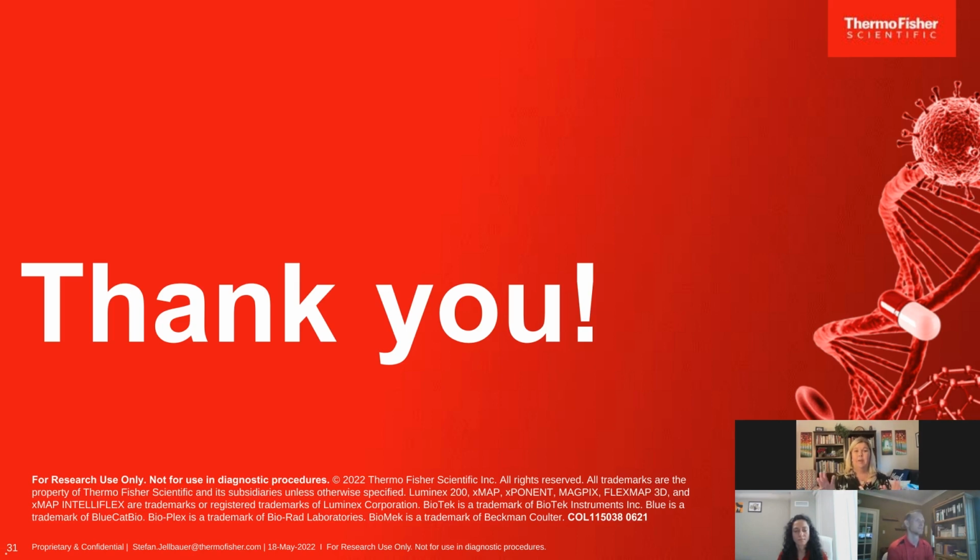Thank you so much. And I want to thank our audience for these great questions. Our next audience member says, I'm doing a large cell culture screen with thousands of compounds. How do I do my sample prep for QuantiGene Plex analysis?